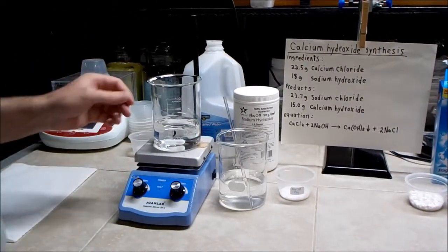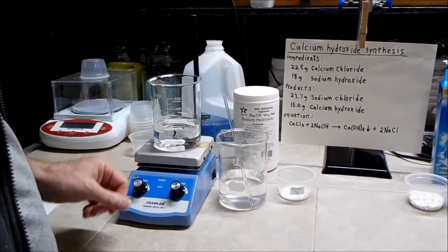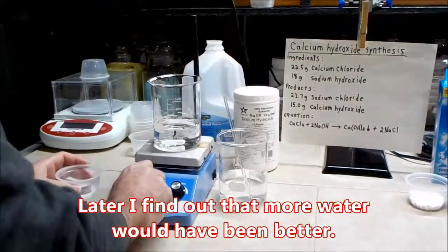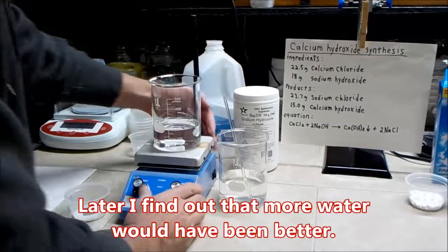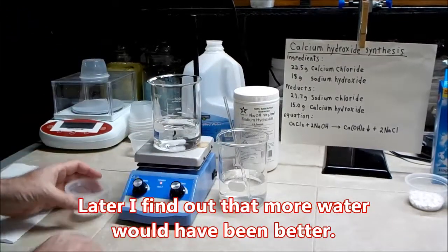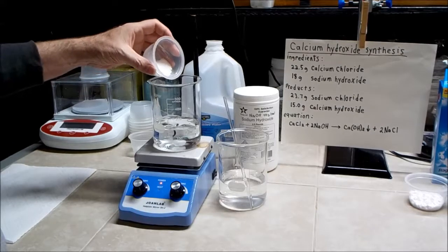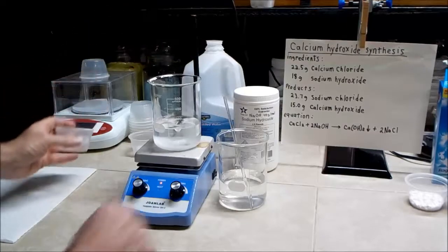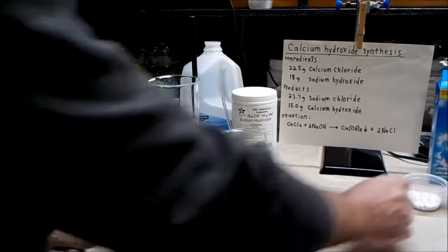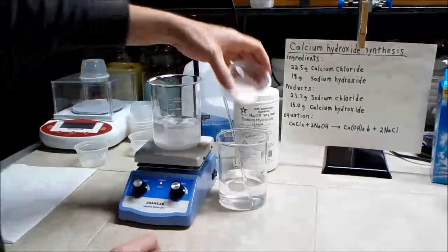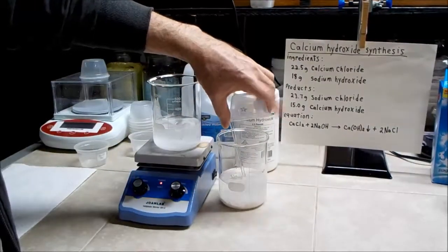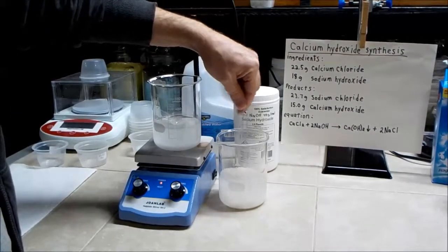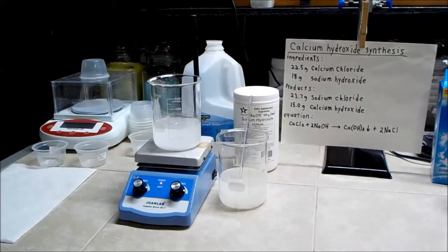So in the beakers here I have two beakers with 200 milliliters of water in each one. So I'll just dump in the first, I'll turn on the stirring, then I'll dump in the sodium hydroxide and get that dissolved. And in the other beaker I'll add the calcium chloride and I'll stir that around. And I'll be back in a minute after everything is dissolved.